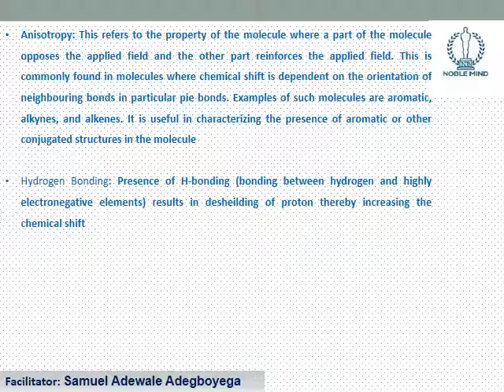Another factor is anisotropy, and this is a property of a molecule where a part of the molecule opposes the applied field and the other part reinforces it.